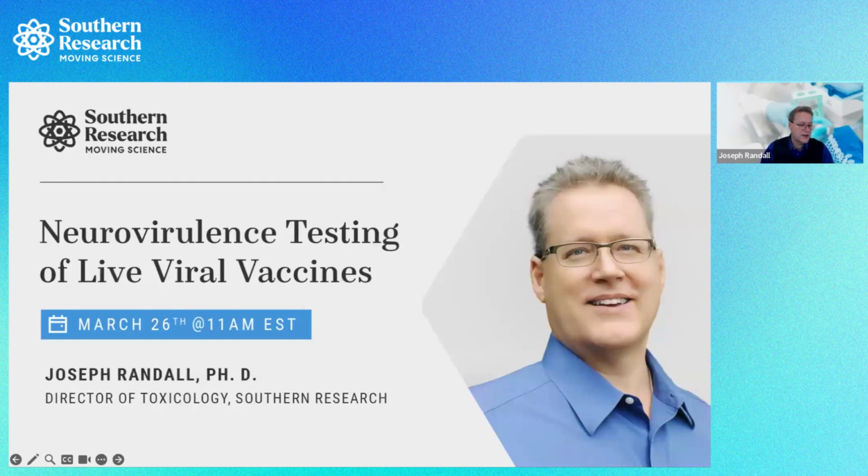So what I'd like to talk to you about today is the central nervous system safety testing of live attenuated viral vaccines. The CNS safety of vaccines has received a lot of public attention since the SARS-CoV-2 pandemic, and we have invested in new technologies to evaluate the CNS safety of vaccines. So today I'll be discussing the neurovirulence test, which is designed to evaluate whether vaccines are sufficiently attenuated to remove central nervous system side effects. That's the major focus of today's talk.